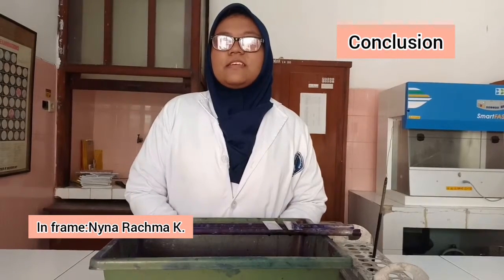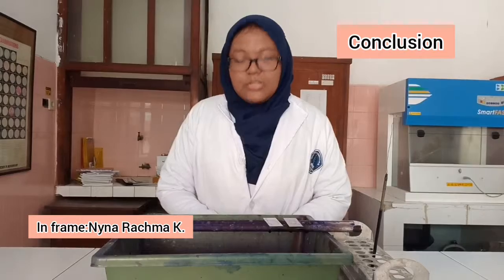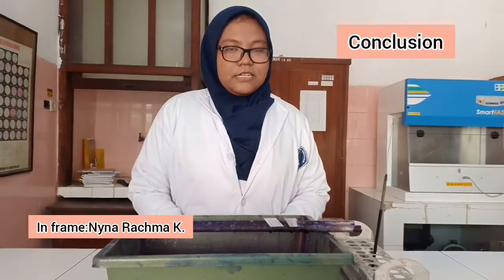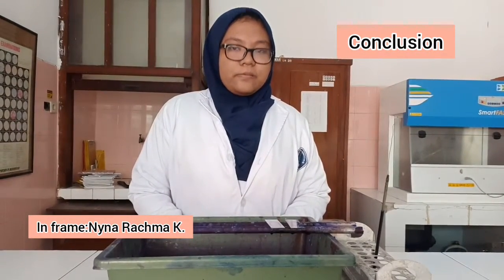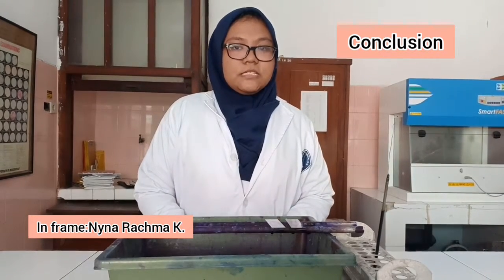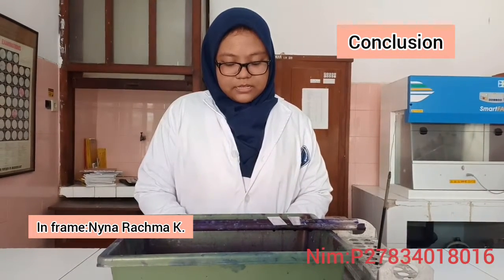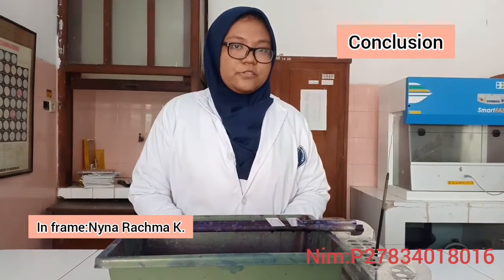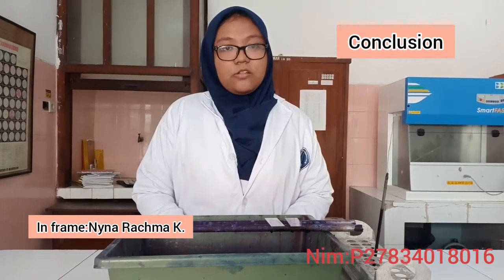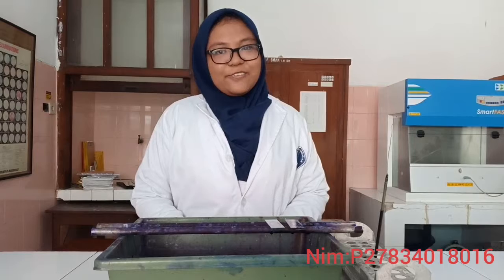After the staining step is completed, the next step is to observe the bacteria under the microscope. Through 100 times magnification, the bacteria will look bright red. The difference between Ziehl-Neelsen and Kinyoun-Gabbett lies in the process and the dye used. So, that's all for the acid fast staining of bacteria. I hope you understand. Thank you.